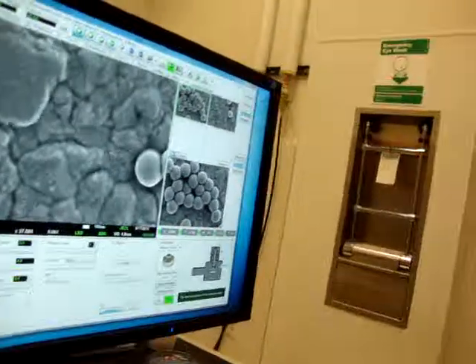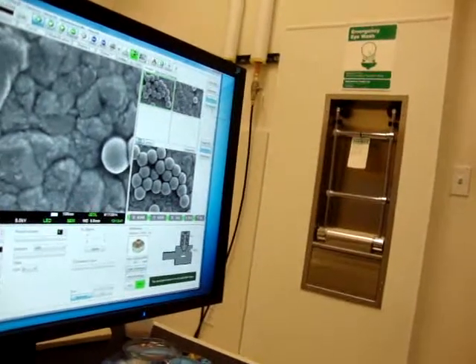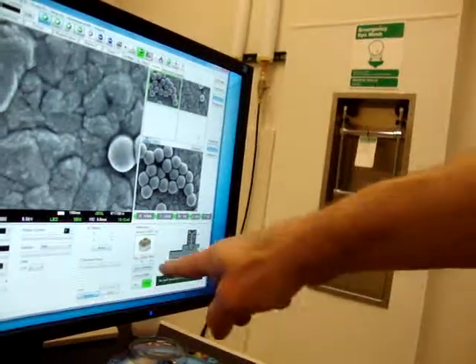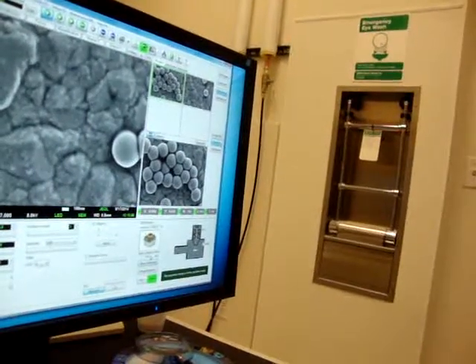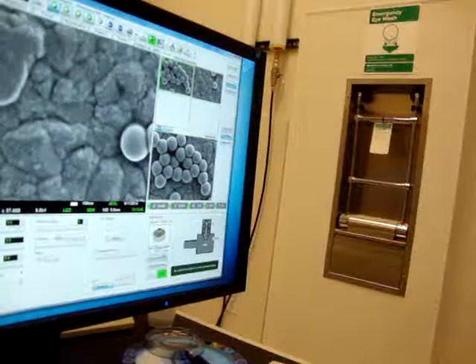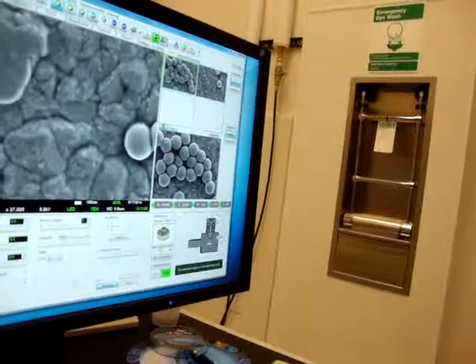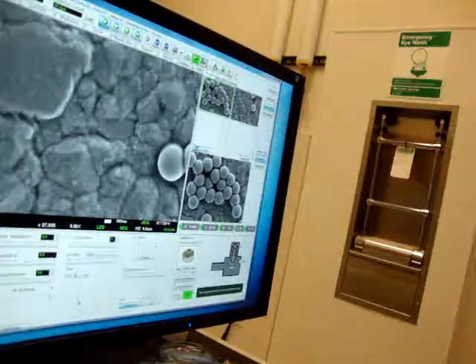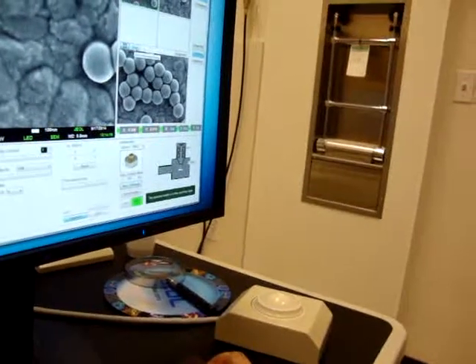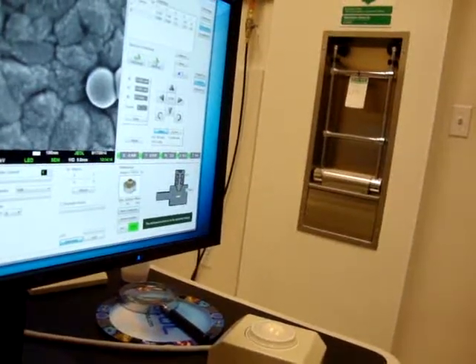Yes, and then you can actually get a pictorial view of the actual tilt. So I guess now you're back to 0 again. Is that default? Surface. Oh, they added vented and you have to put that back in every time? Yeah, for every sample change you have to proceed. So it's not a set value, you have to put it in because it's always changing. Got it. Is there a way to fix that? It should stay there permanently.